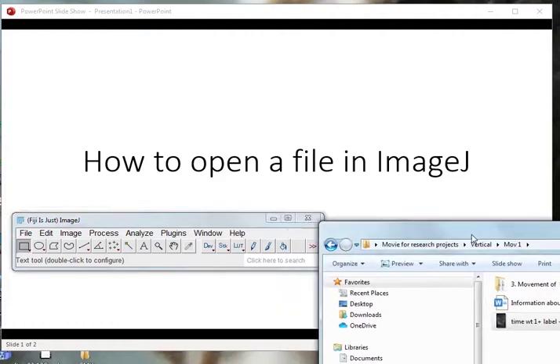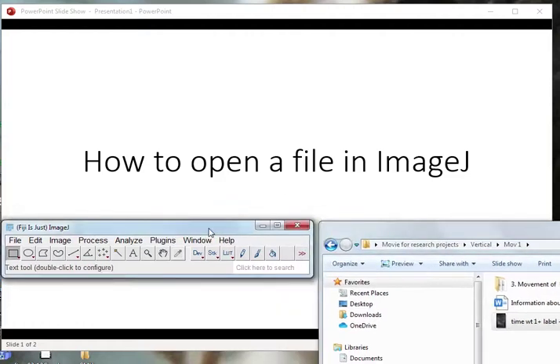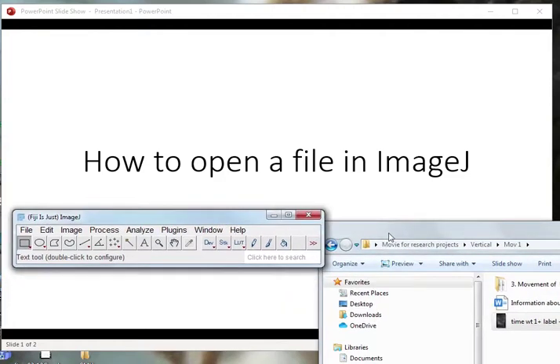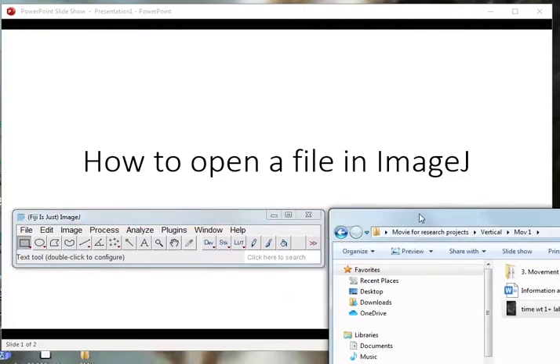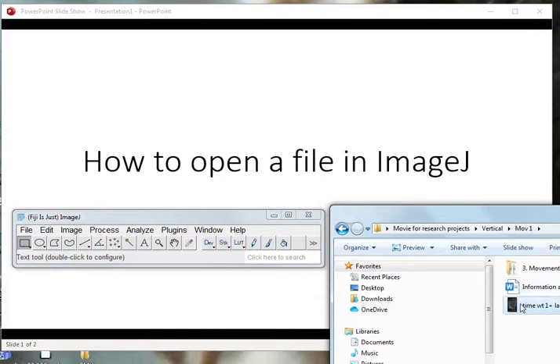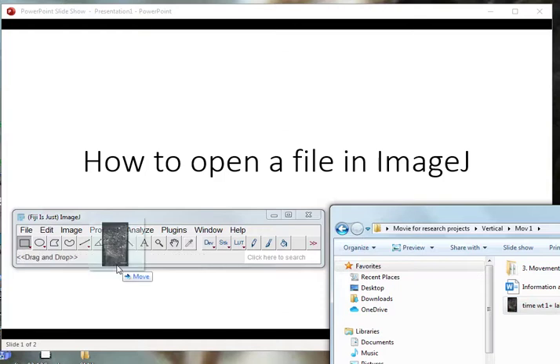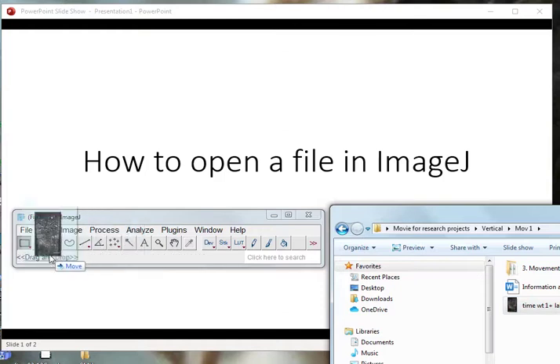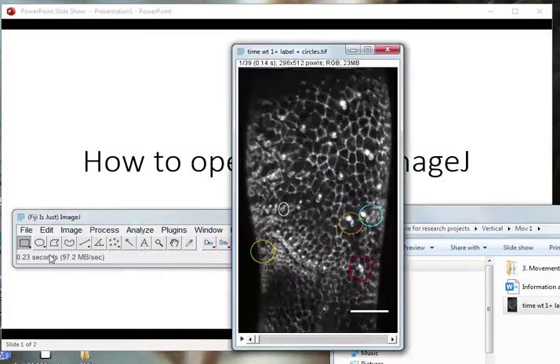Okay, so how to open a file in ImageJ. You open the image and then you open the folder where, for example, here is the movie that I want to open. I take the file, left-click, and I just drag the file.